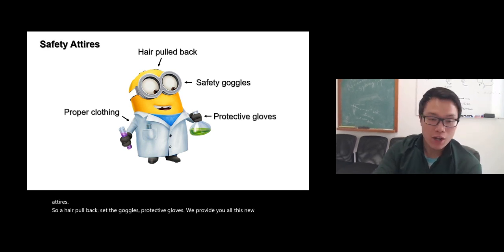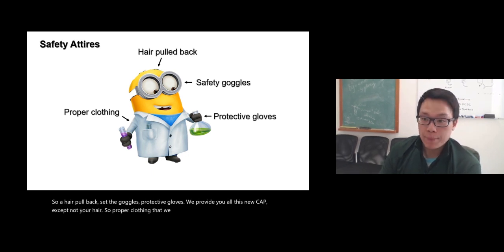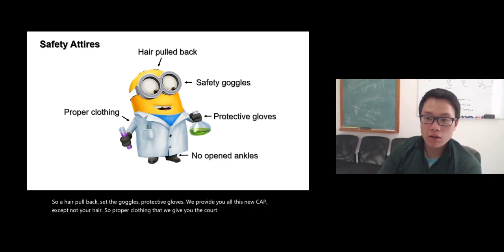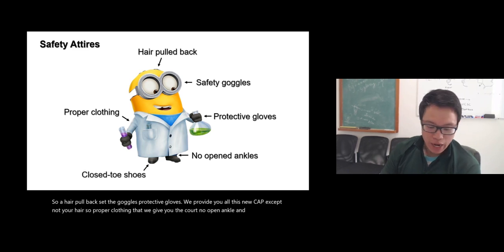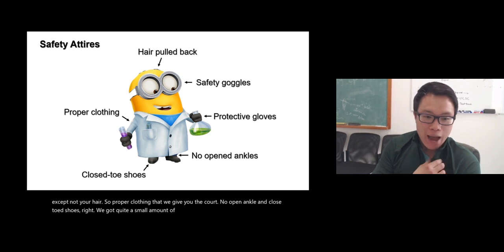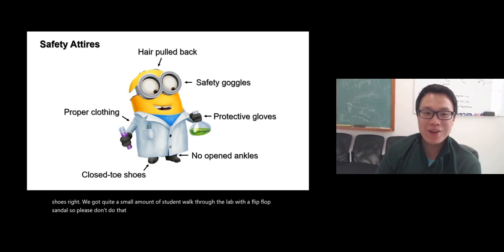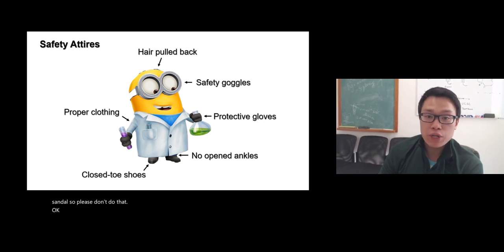Except not your hair. So proper clothing, we give you the lab coat, no open ankles and closed-toe shoes. We get quite a small number of students walking to the lab in flip flops or sandals, so please don't do that. All right, that's pretty much all you need to know.